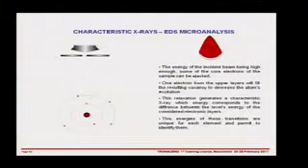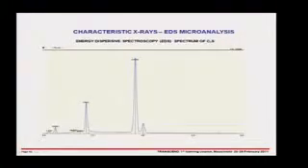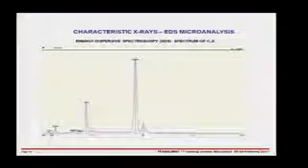So if we just run that simulation again, you see the electron comes in, knocks this electron out, this electron falls down, and you get the X-ray given off. So typically you'll see a spectra like this according to the energy, and this is the most common method you use, that you have an equivalence between the energy of an electron and its wavelength.